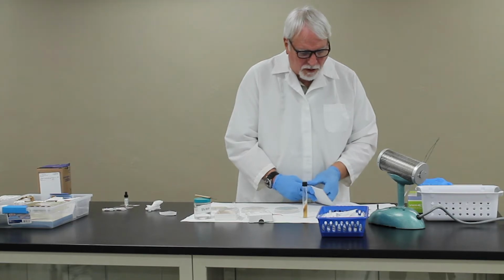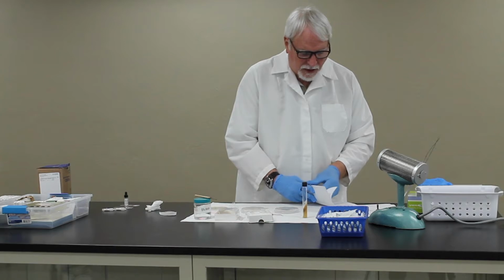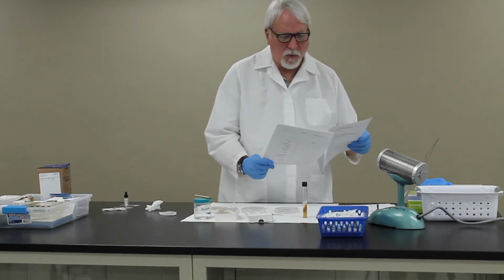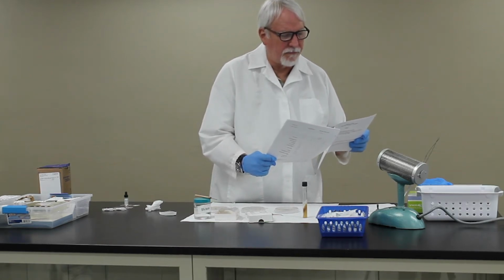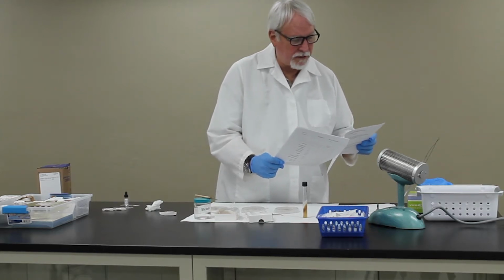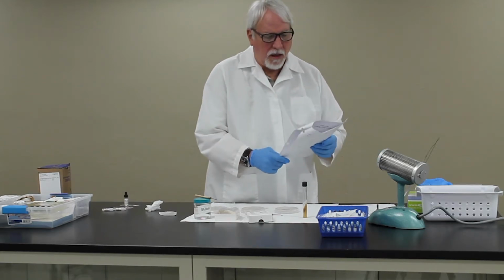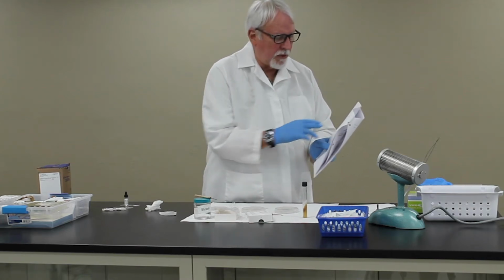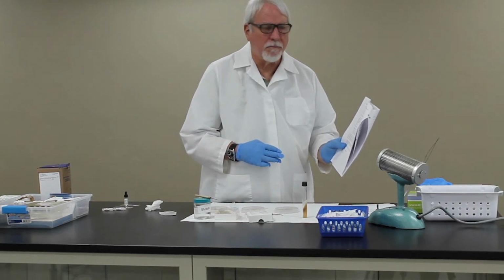And we're going to start today talking about the first exercise, which we refer to as unknown number 1, and that's your saprophytic fungi and dermatophytic fungi. So your pathogenic fungi and your saprophytes. What we do with each of these lab procedures is we will give you a list of a number of different organisms that your unknown may potentially be.